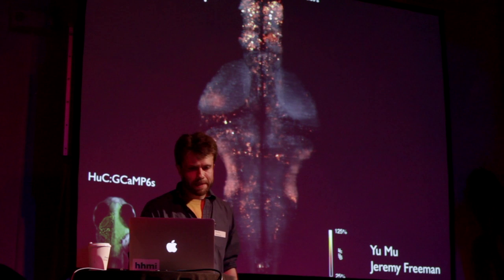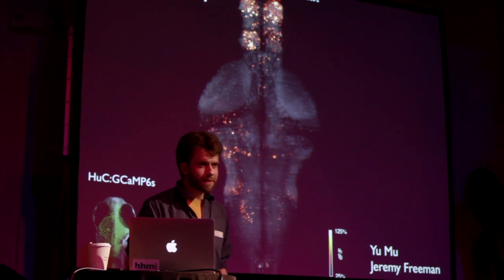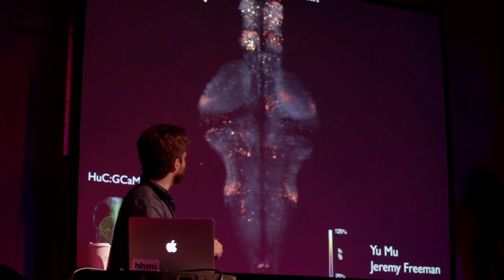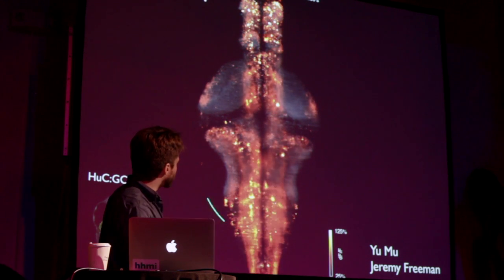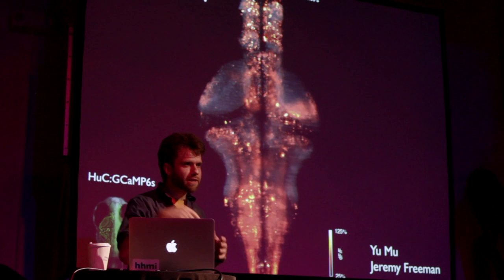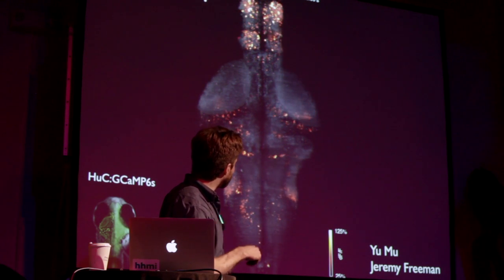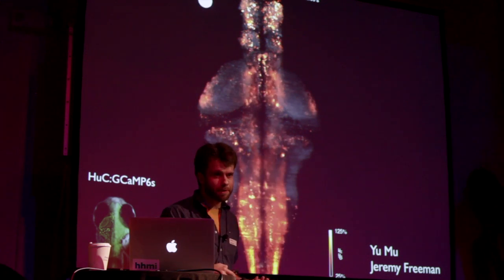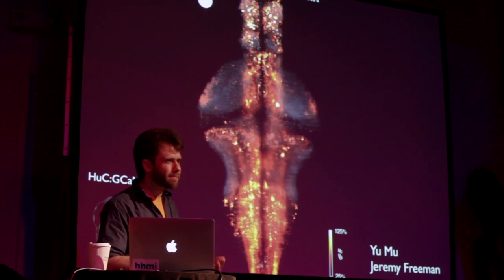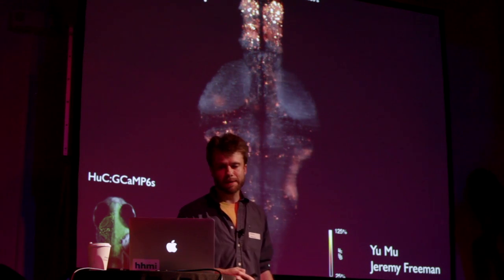And here's an example of this. This is the stimulus here. It's again a moving grating. When the grating moves, the fish swims along with it. This is now the strength of swimming, this dot. And here's whole brain activity. It's a projection from above. And again, when the fish moves, there's a lot of activity in the hindbrain. In the forebrain, there's always activity, whether the fish is swimming or not. So different brain areas have very different properties, and we're trying to understand how they interact.